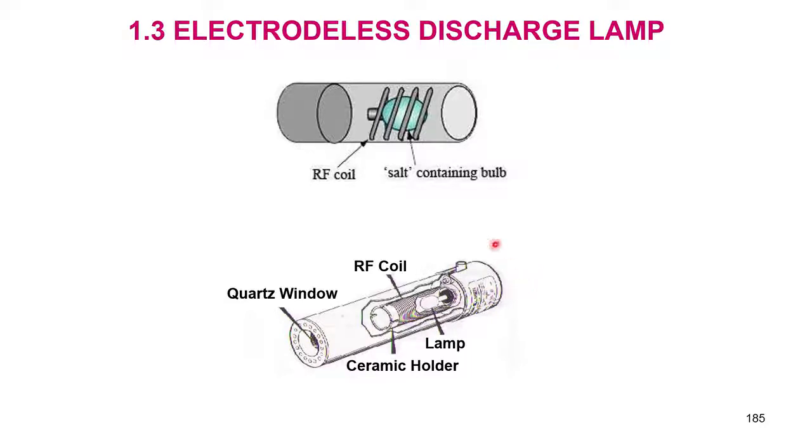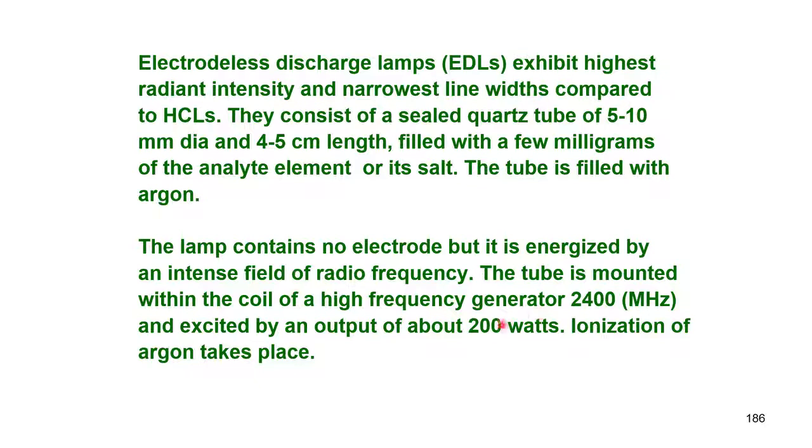So, it becomes sort of intellectual property also, the design. Okay. So, we have this, they may change this generator frequency, they may change from 200 to 150 watts or 250 watts.